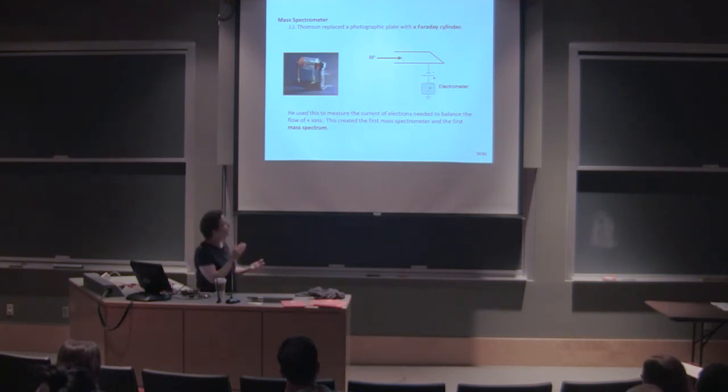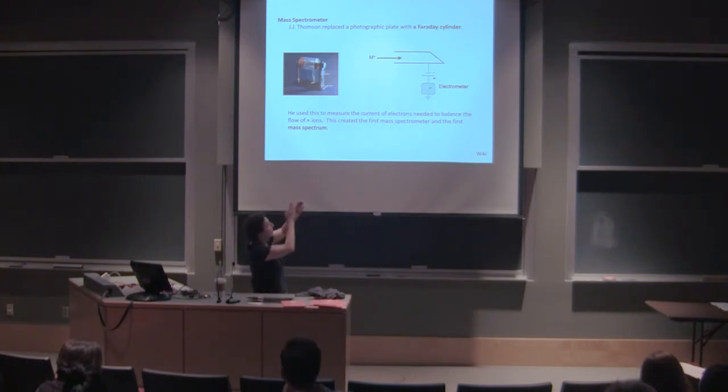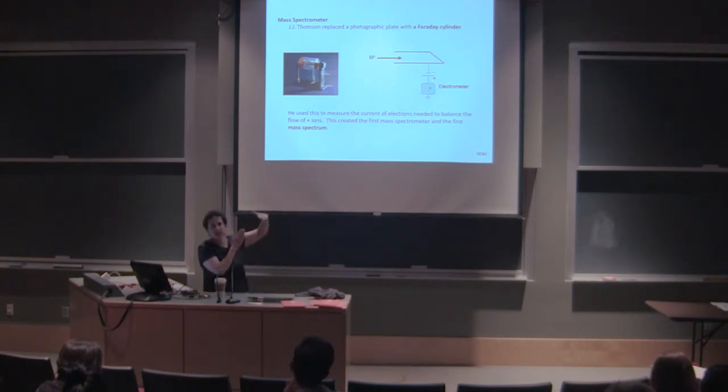Anyway, the Faraday cup collects the ions. They come in, and a current is fed to that cup to neutralize the positive ions. So you have electrons coming in to match in quantity the number of positive ions hitting your cup. And you just measure the flow of electrons, which is otherwise known as a current, right? And that's actually what gives you your isotope analysis.